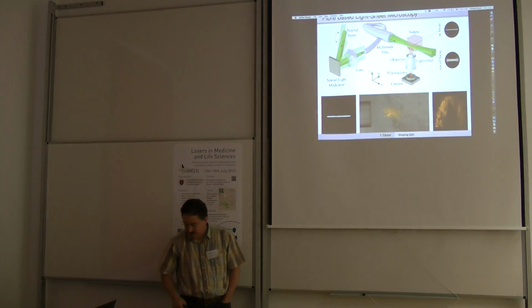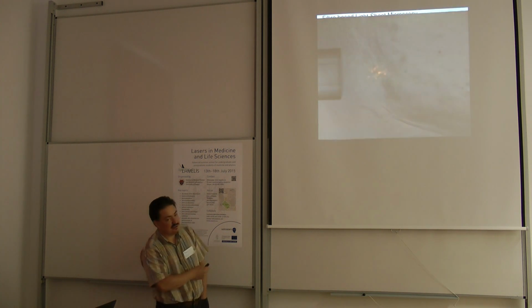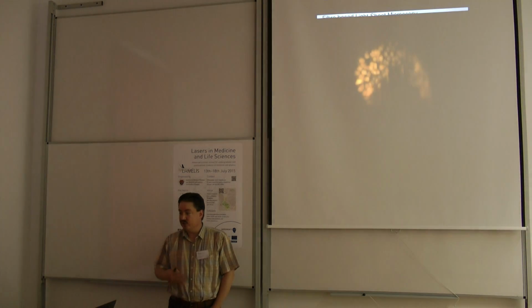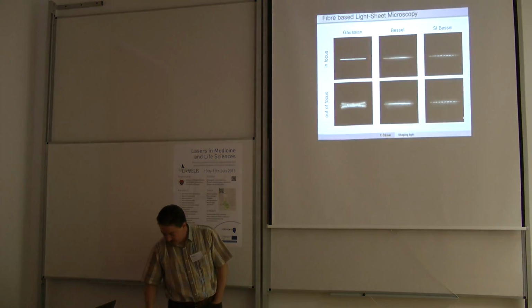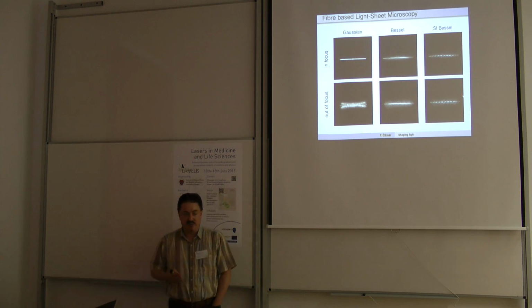And if we send the light sheet into the sample, very close to a tissue, we can selectively excite layers of the specimen, and then it allows us to reconstruct very nicely the 3D distribution of the image. This time it's nuclei that we are looking at. And just to show you how powerful it is, you can also implement all these advanced methods, including structured illumination, that can possibly allow us also to increase the field of view.